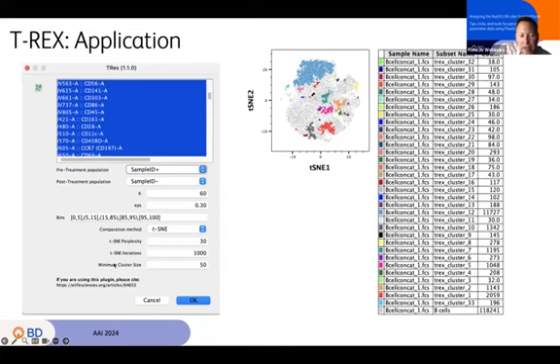One feature that I think is fairly nice is you can specify a minimum cluster size. So if you put in a one there, you can get down to some really, really small places where there's one cell, or maybe only two even makes sense, two from the same condition and none from the other. And that's probably not super meaningful to your research. I used 50 here. I said, show me a spot where we've got a cluster that gets formed by the DBSCAN tool of at least 50 cells where there's real difference between the two patients.